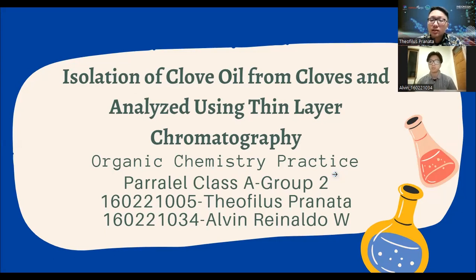Emma. Today we from Parallel Class A Group 2 will be presenting about isolation of clove oil from cloves and analyze using thin layer chromatography. My name is Theofilus Pranata and with my friend here is Alvin, Reinaldo, Wibawa.